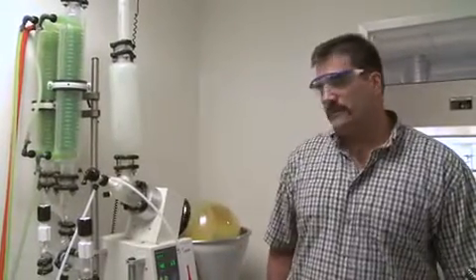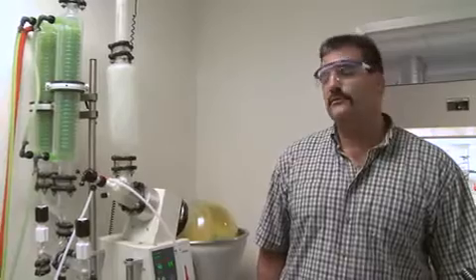We started using the R220s about eight years ago. We bought a Buki and a competitor's model right off the bat. Obviously, as you can see from our lab tour, the Buki won out.